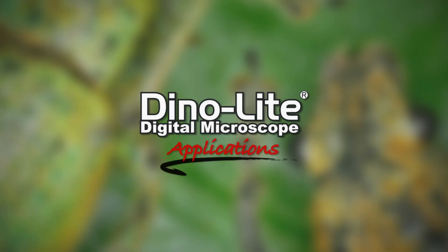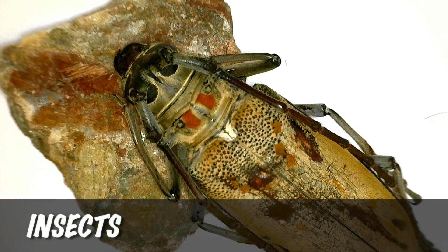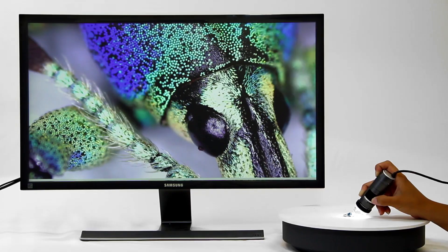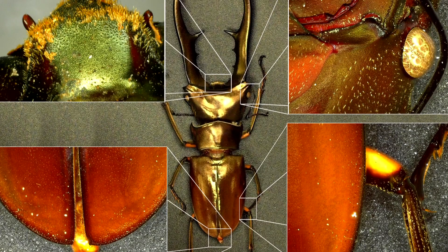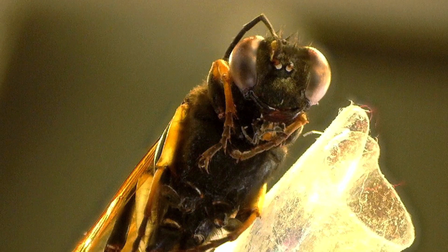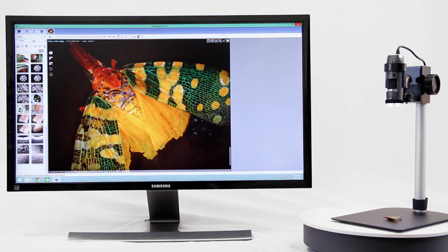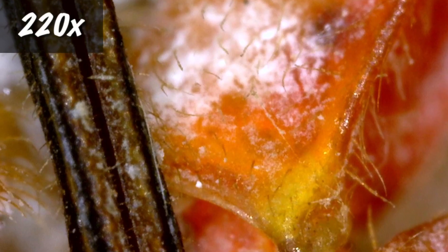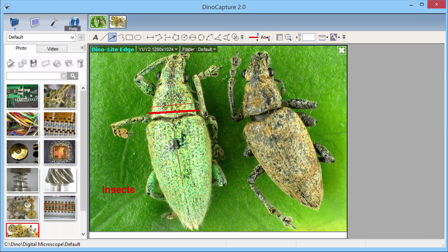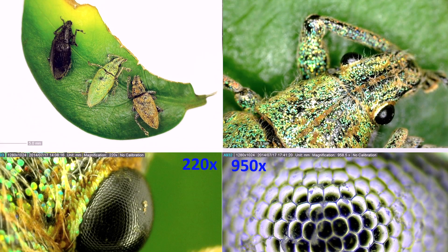This is a Dynolite digital microscope applications video about insects. All of the pictures shown were captured by Dynolite microscopes. The Dynolite is a handheld microscope camera with most standard models going up to 220 times magnification. High magnification models go up to 900 times. These models are connected to a computer via USB and include easy-to-use software that allows users to capture images and video, as well as many other basic and advanced features. Here are some magnification examples.